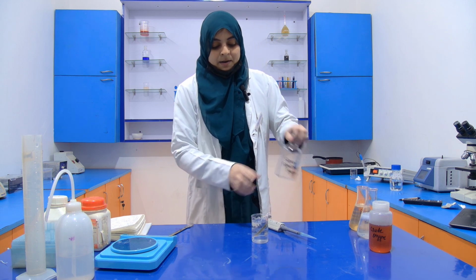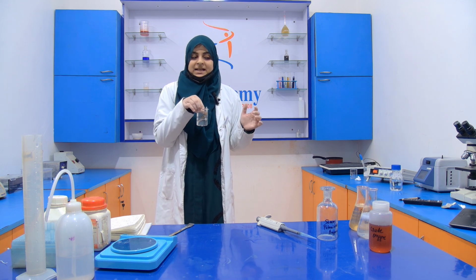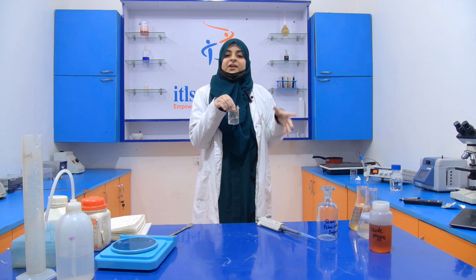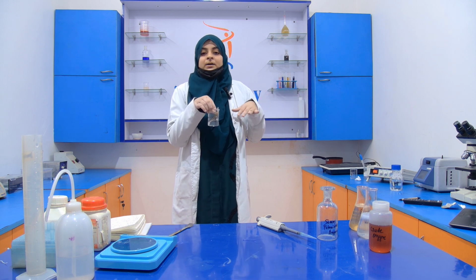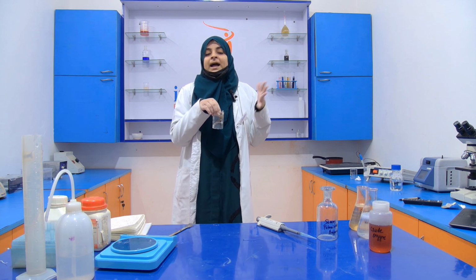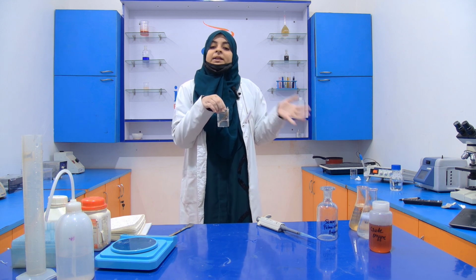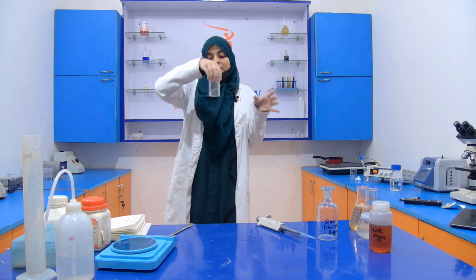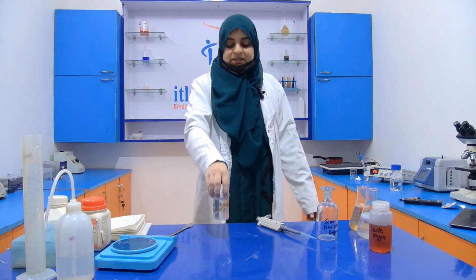Now this should be kept inside the refrigerator at 4 degrees Celsius overnight. Then after incubation at 4 degrees Celsius, tomorrow we will keep it in the shaker, in a continuous shaker, and every 30 minutes we change this potassium phosphate buffer for 3 hours. Then after that we get our dialyzed protein. So we will see the result tomorrow. Now I am going to keep it inside the refrigerator overnight.